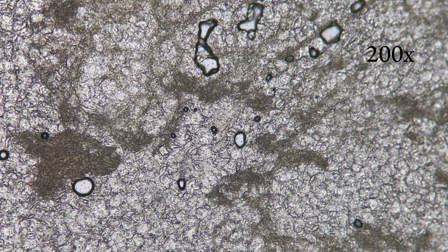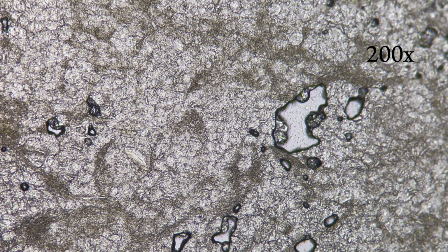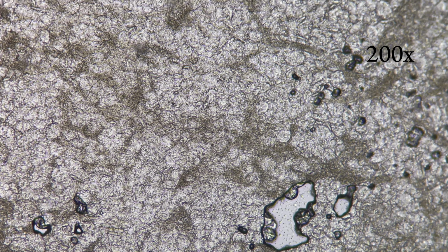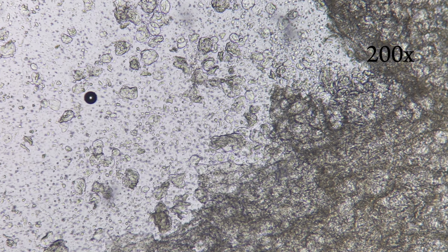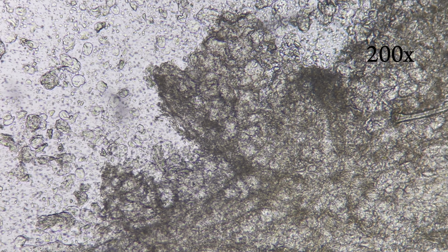At this level, it becomes clear that bread is not simply solid food, but a carefully formed balance between air and structure. Much of what we experience as softness comes from these microscopic empty spaces.